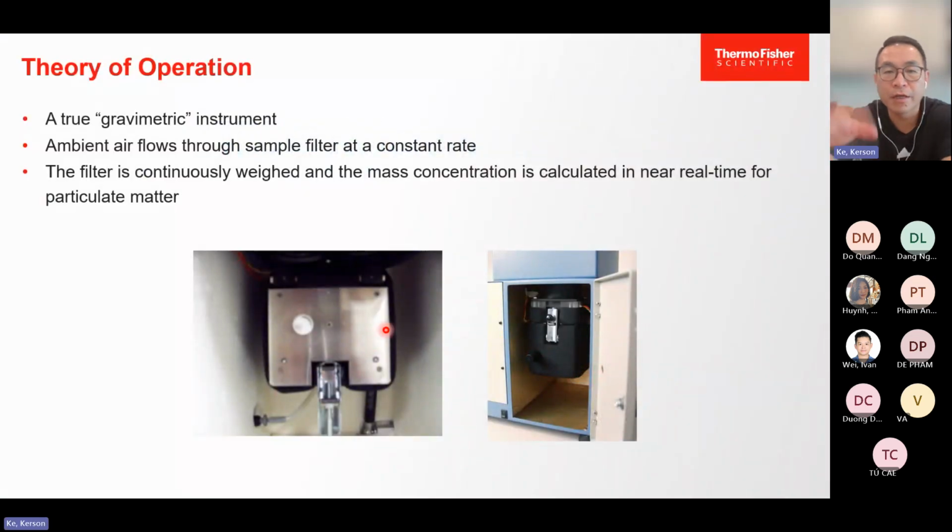So in this video I will introduce how the TEOM operates. In the TEOM 1405, you can see the microbalance in this chamber. This is the filter, the 13mm filter. You need to put the filter on top of the microbalance, at this point.